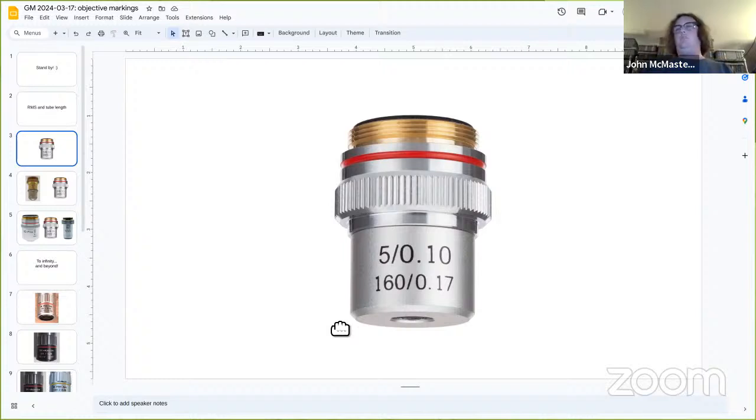It's all the same concepts, just with different terminology. Perfect. Cool. And so this is like the most basic design that you could possibly think of. Basically, a lens, you have some distance back that you want a focal plane, and you can put either a more powerful lens or a less powerful lens. And as long as they all focus at 160 millimeters beyond that, you can swap between them. Does that make sense so far?